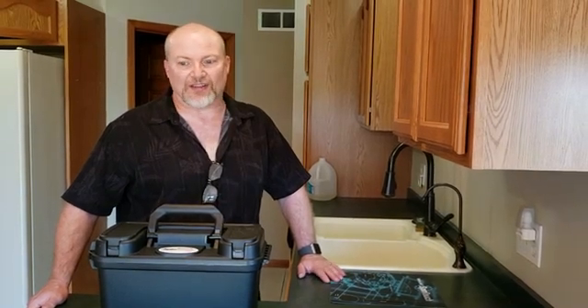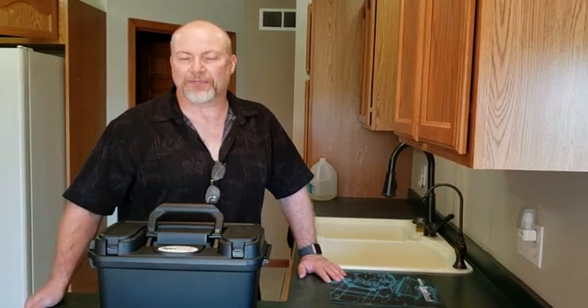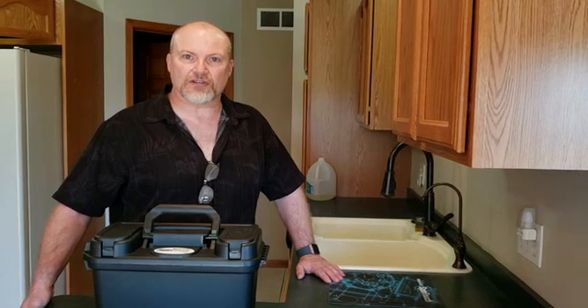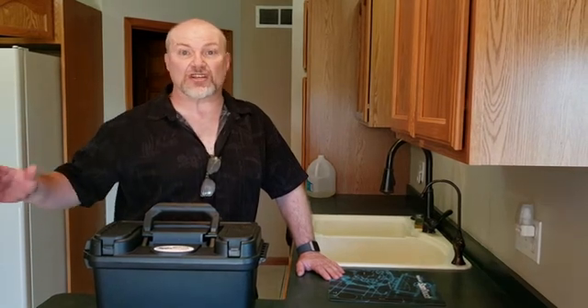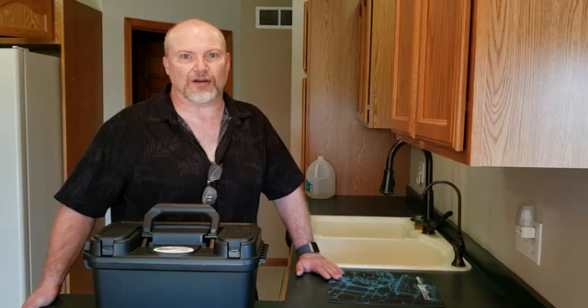It's so fast and quick, and the thing that I love about it is — if this does what I expect — it's going to be an awesome tool for plumbers, well drillers, or service techs that don't have the time to do the thorough, complete demonstration or water testing that they really should be doing in the home.